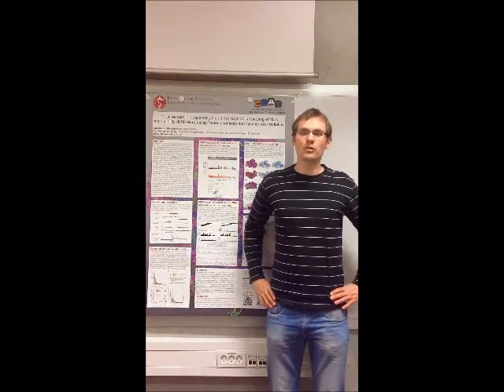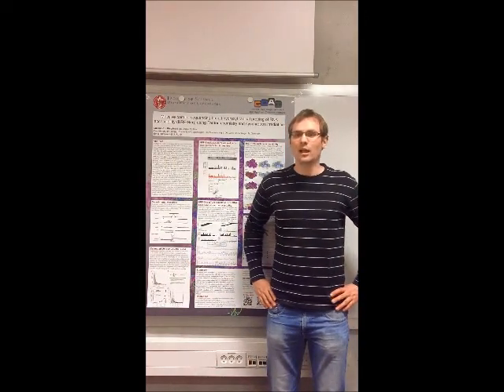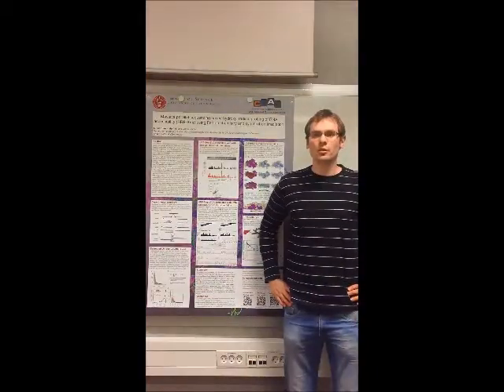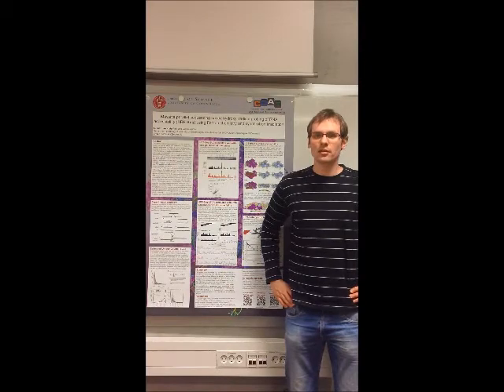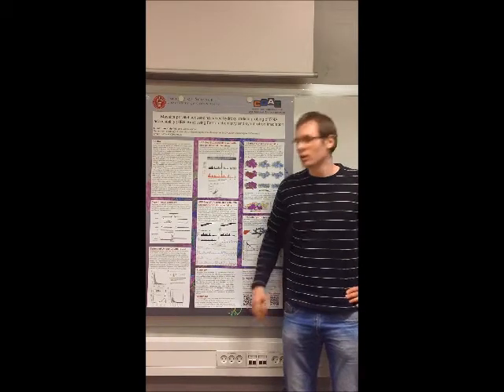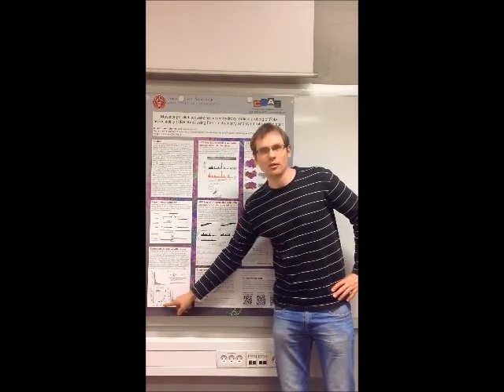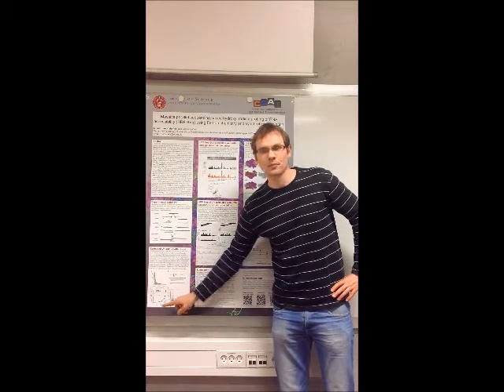Therefore, we generalized the method, allowing for unequal barcode frequencies. EUC calculations are consistent with counting unique barcodes for lowly expressed fragments, but make a big difference for abundant ones.